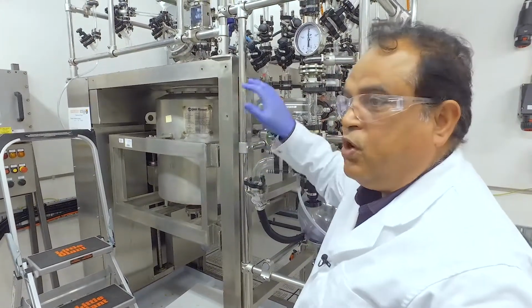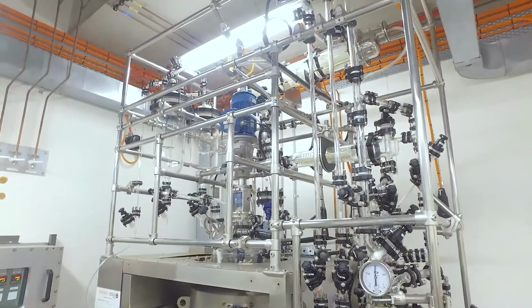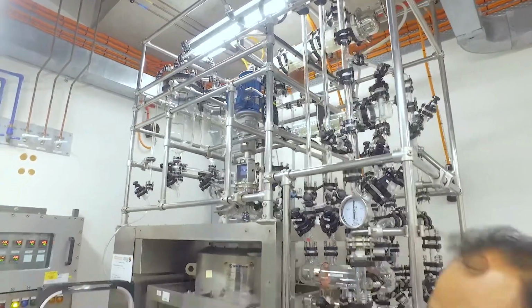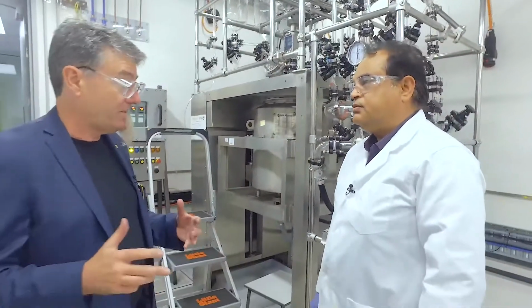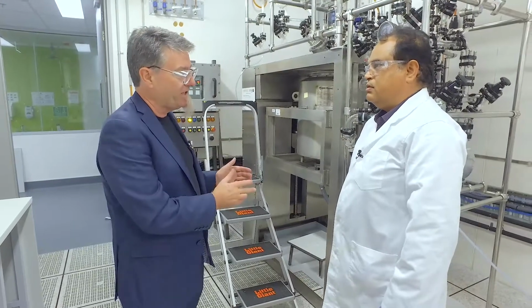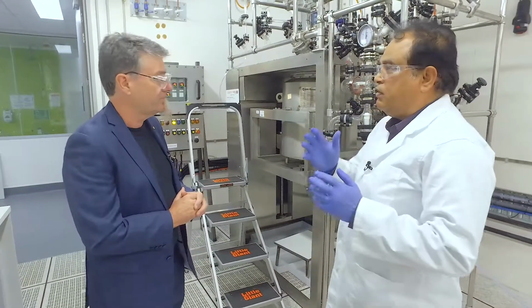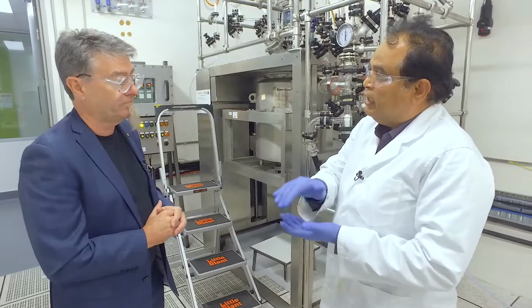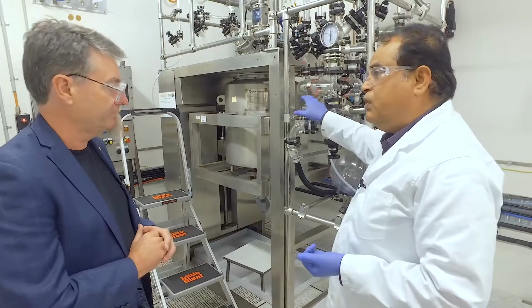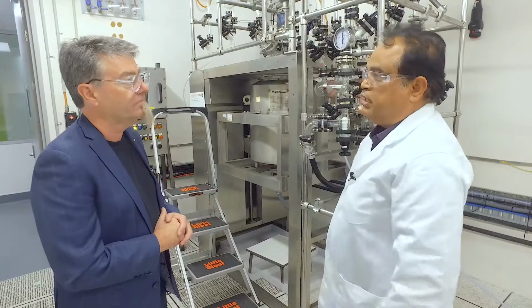So what we have been doing is optimizing the conditions of the reactions so that we get similar quality to what we were getting in the laboratory. There are so many parameters involved, so we are optimizing them one by one. So I guess that's why it's very important when we're working on the bench that we keep everything as simple as possible, yet try to maximize the properties of the graphene and its processability. Absolutely, you're right, Gordon. It is important at that stage as well to monitor the critical parameters, and then implement very carefully to see how effectively we can optimize here as well.